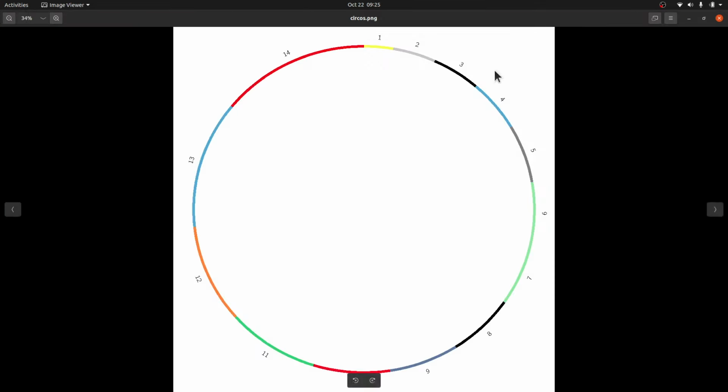There's something I want you to see. If you take a look at the labels, the font size, to me, is small. So it's possible to change the font size. Don't forget that these things here are the ideogram. The ideogram plotting and displaying every information is found in the ideogram.conf.